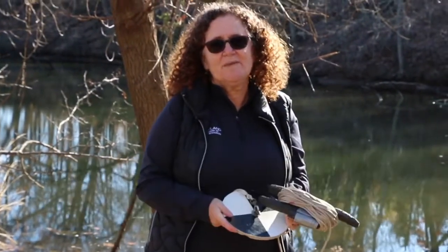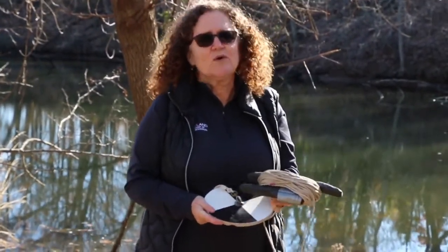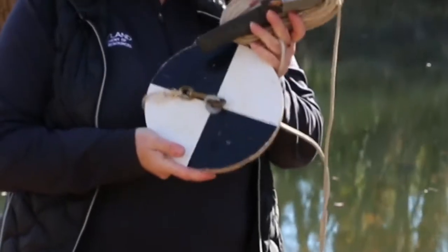Today I'm going to talk to you about measuring an important water quality measurement for turbidity or clarity. We're going to use the Secchi disc.